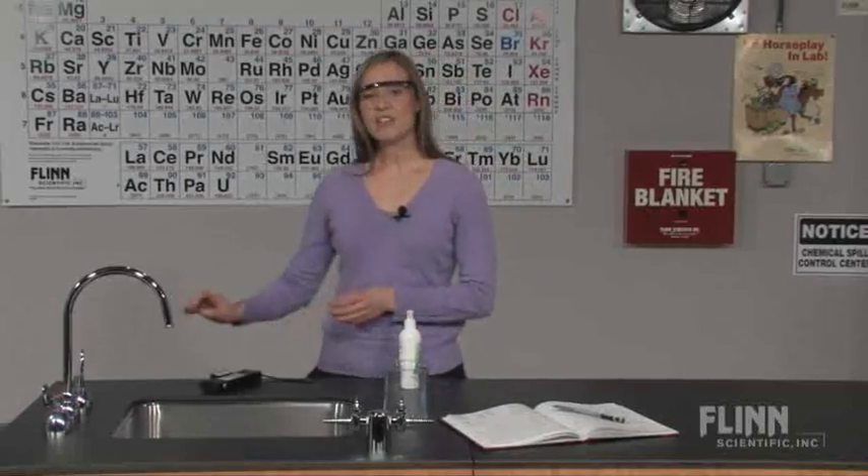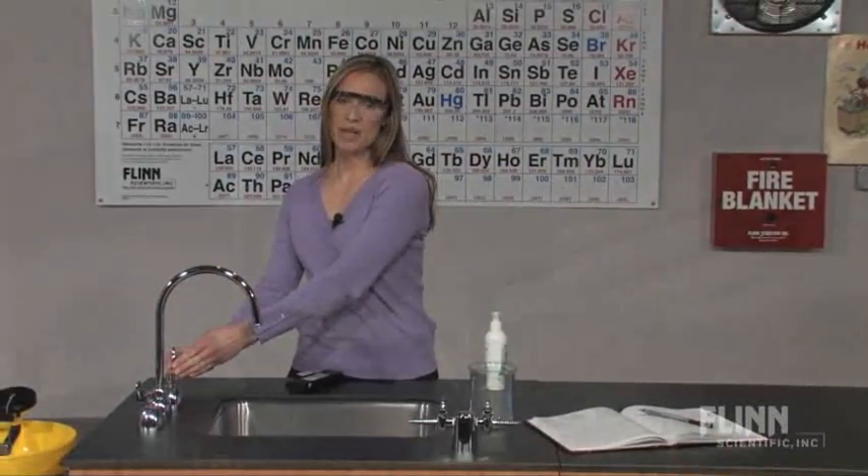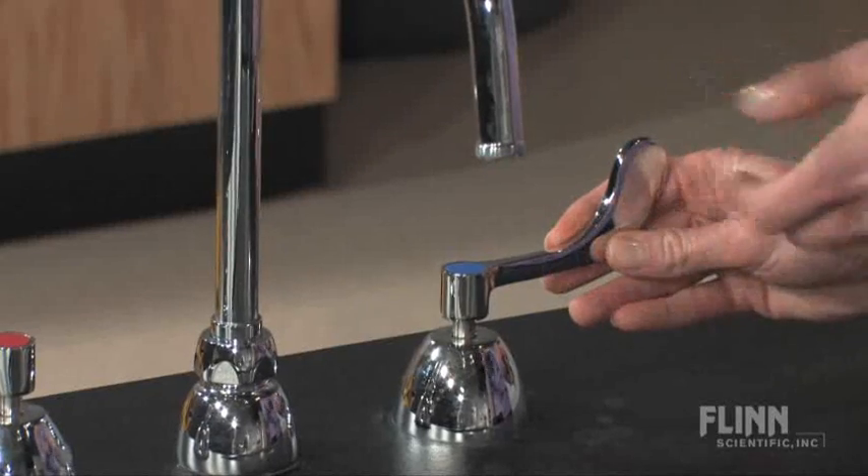The only extra thing you need for this activity is a UV lamp. Just before students arrive in class, place a small amount of Glowing Germ Lotion on something in the classroom that many students will touch, like a faucet.